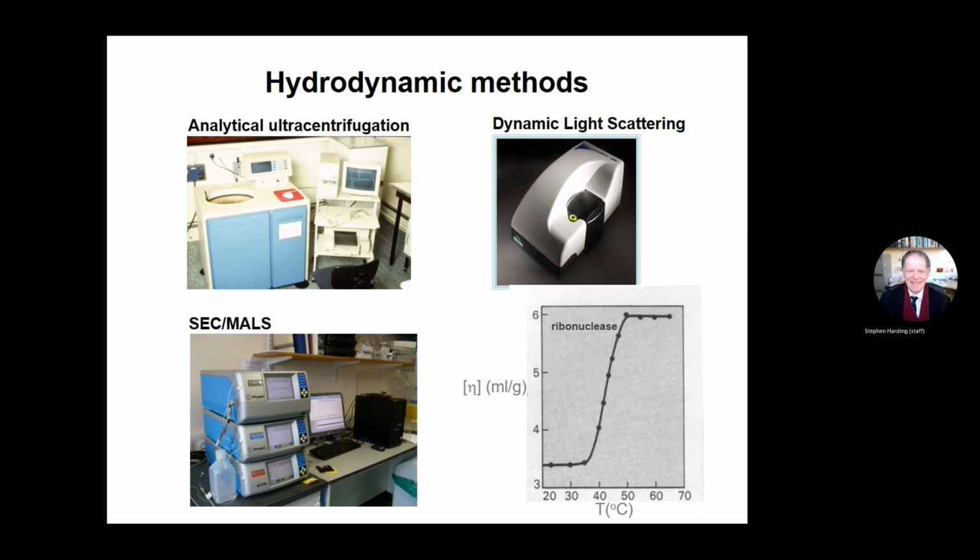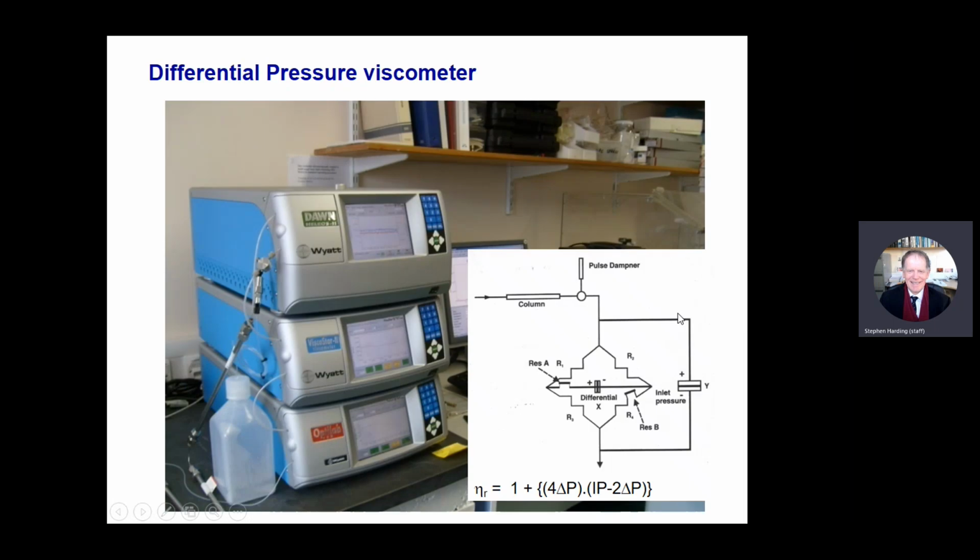It's a very sensitive function of conformation. We've done that. So, for example, you want to look at a protein denaturing. This is the usual value you get for a globular protein, about 3.4, 3.5. As temperature increases, the molecule denatures. And why does it form a plateau here? That's because it's fully denatured. You can't get more denatured than fully denatured. That's why it does that.